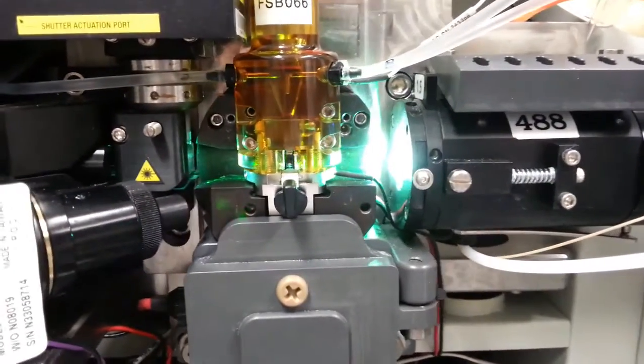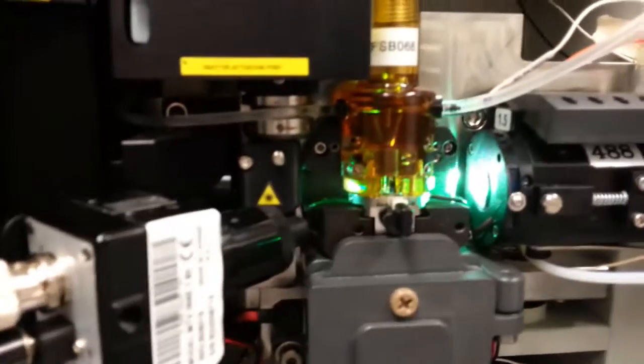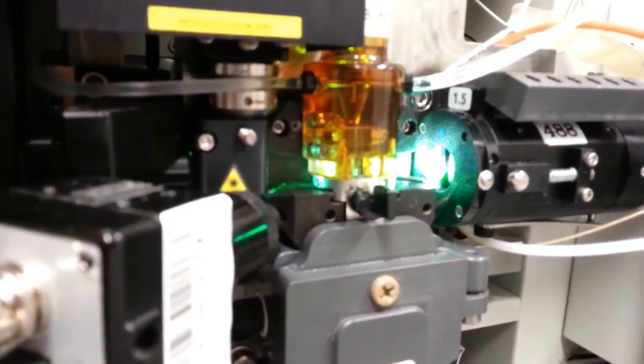Let's look at the lasers. So this is the laser in the machine, and the cells are dropping through that path. So this laser is detecting each cell one at a time, and giving a reading to the machine.